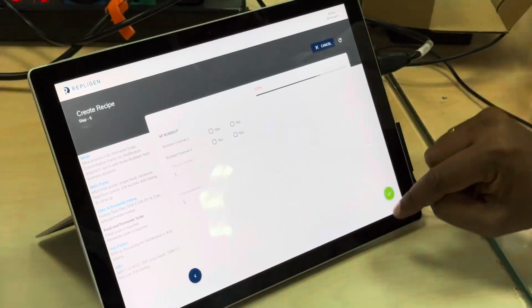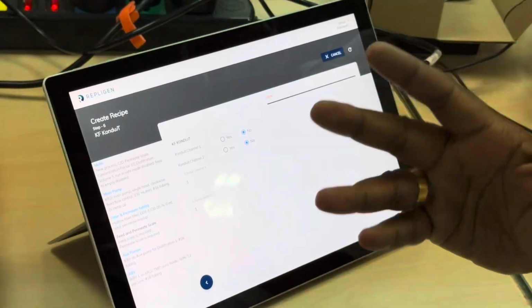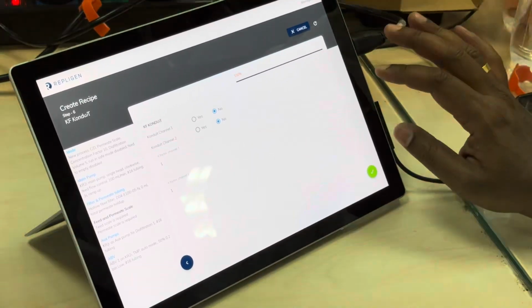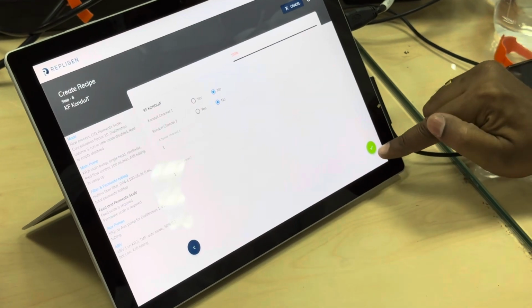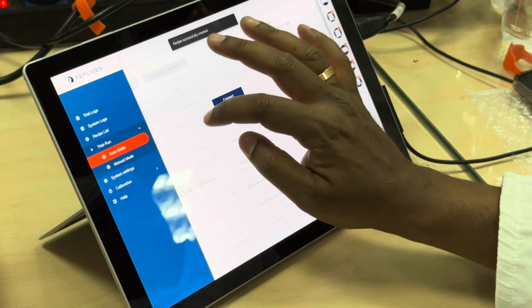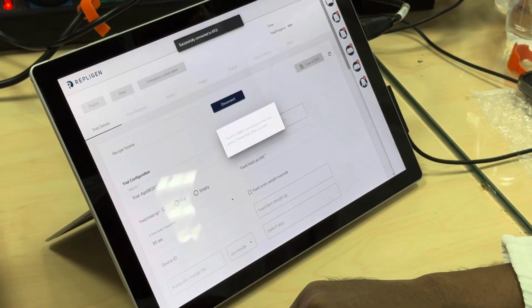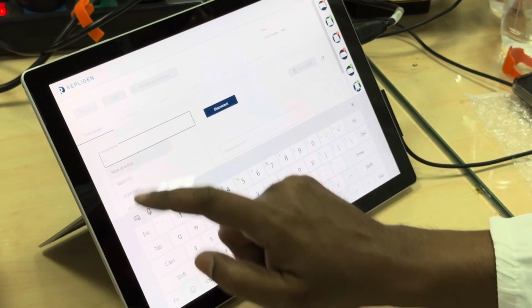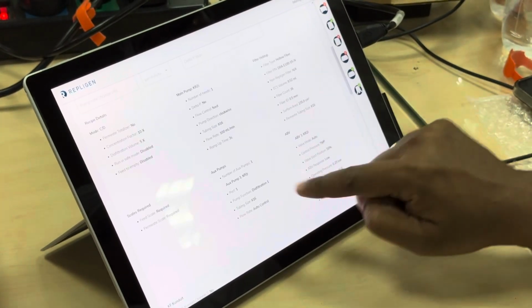Okay, that's ready. Now it asks for conduit information. Anyway, we are not going to use conduit. Now the process is ready for the next recipe. Now we have created a recipe here. So once you touch the recipe, first you connect, touch the recipe, the recipe is ready. Now just select new process, and all the information you can see here.